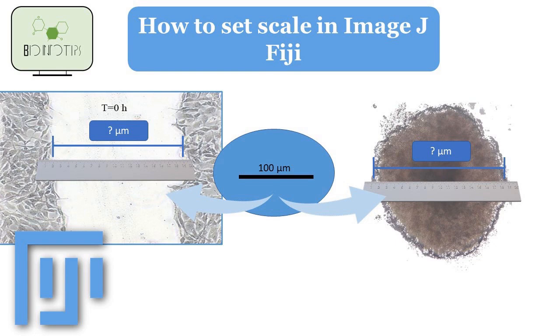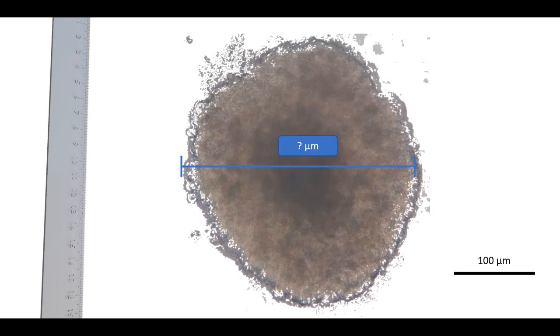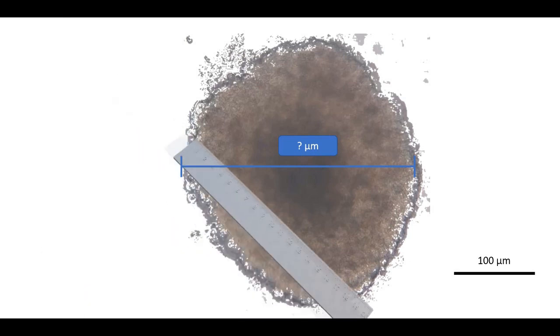Defining the scale in ImageJ is important because it allows you to measure objects accurately in real-world units such as millimeters, micrometers, or nanometers.